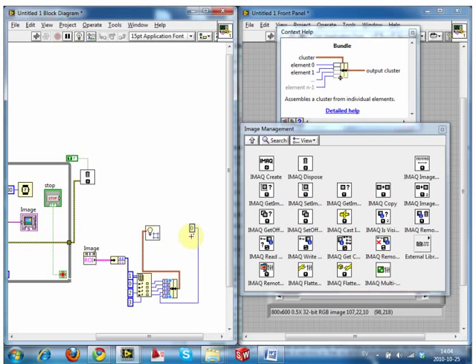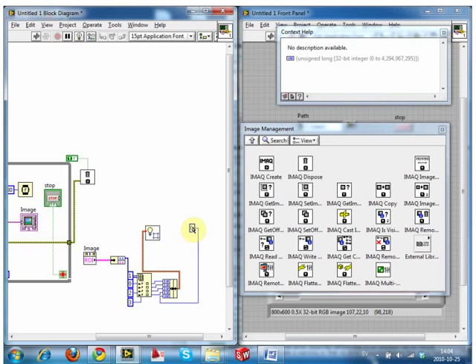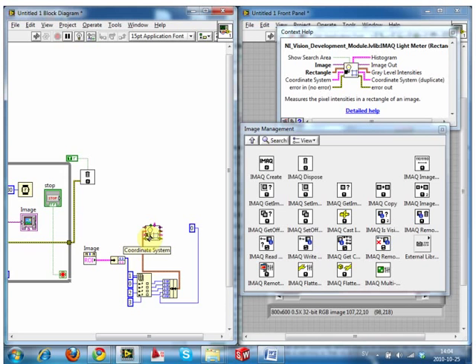The problem is that for angles, it expects them to be non-integer allowed. Like if you give it an angle, 22.5 degrees is a fine angle. But you can't have pixel 22.5. Doesn't exist. So when you're talking about definite objects like pixels or positions, they have to be integers. And if you give it a value that's not an integer, a lot of times, like I was saying, it will try and use it, and it will give you this little red dot saying, I think we're okay, but I'll have to convert something.